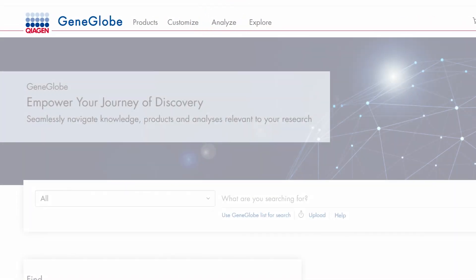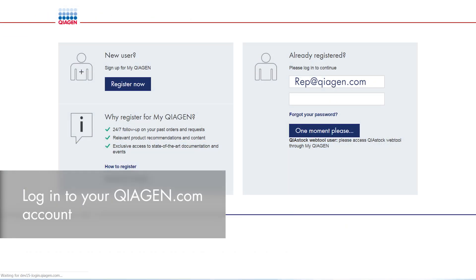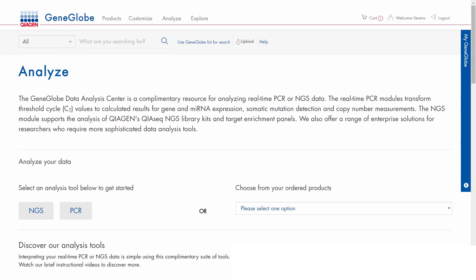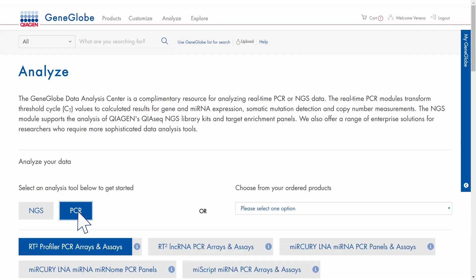To access the analysis modules, you must log in to your Qiagen.com account. Select your previously ordered array from the drop-down menu or click PCR to see the analysis modules.